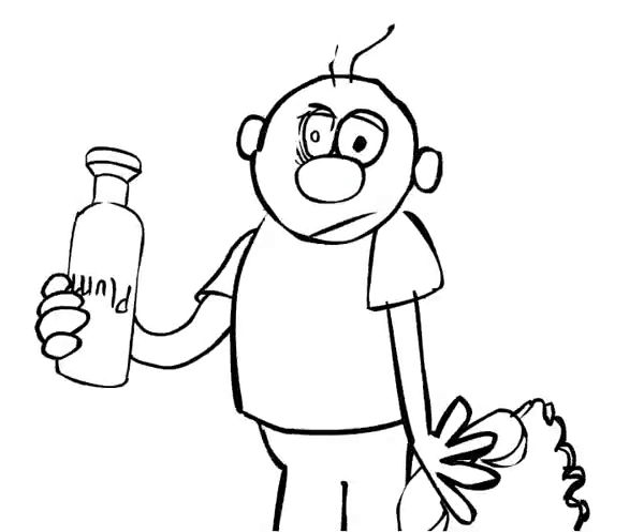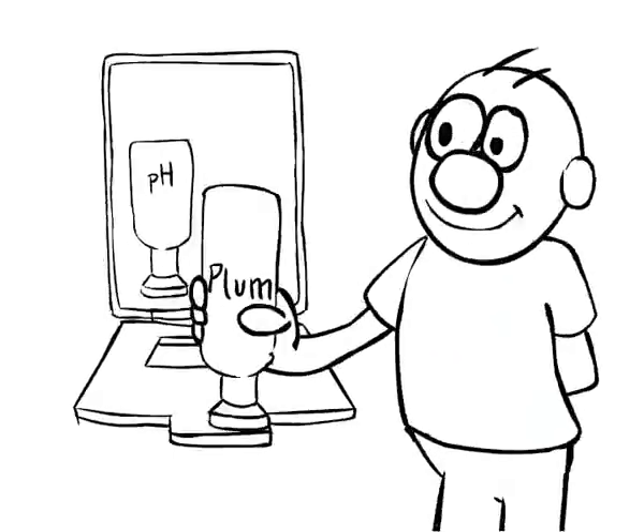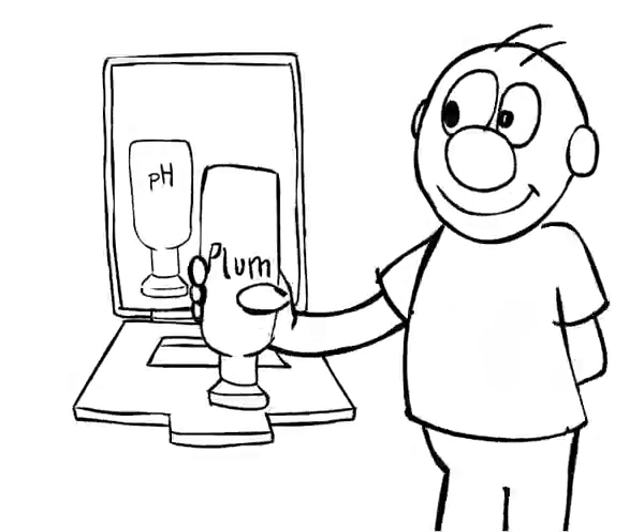Always seek medical advice and continue rinsing with eye wash from Plum during transport. You only have two eyes, so take good care of them.